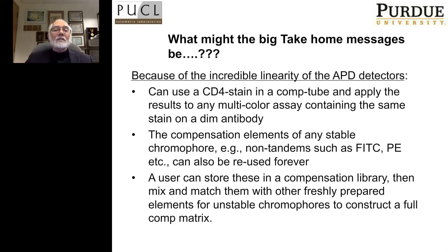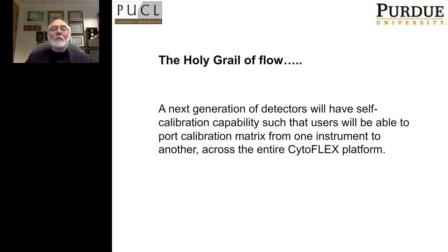So that is the end of my presentation. And as I've said here, this opens up the potential of what may be the holy grail of flow cytometry. That is, a generation of instruments that are completely self-calibrated and are able to do this amazing matrix of compensation across a very broad range of dyes.